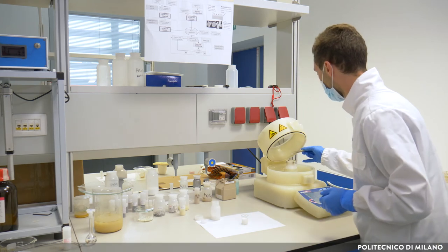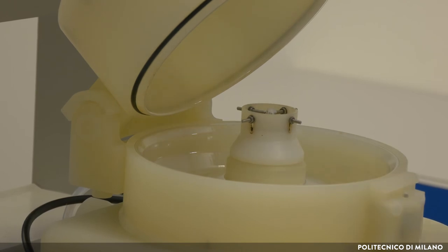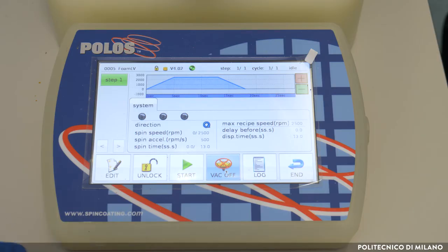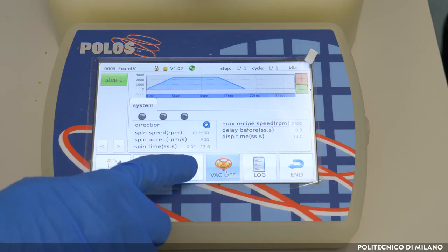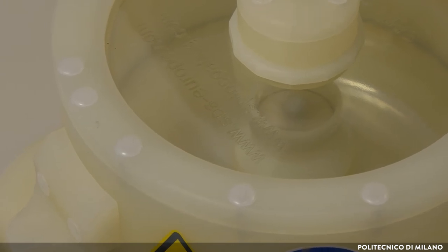Due to the viscosity of the slurry, a wet film of slurry coats the wall of the foam, but the main part remains and blocks the channels. So the excess of the solution is removed from the foam using a spin coater. The instrument uses a program of rotation speed and dwell to the maximum velocity.